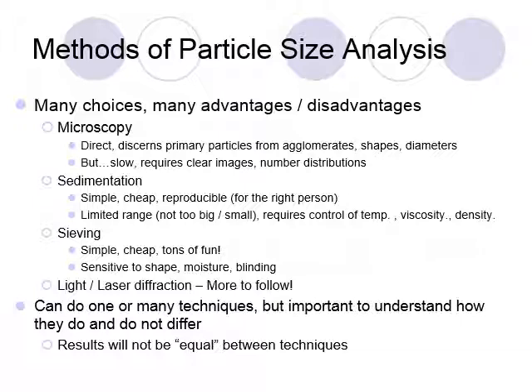All of these choices do matter to get you the particle size in the way that you want the results to best apply to your process. With each advantage and disadvantage, when you make a choice as to how to look at your particles and get the numbers and shape information that you want, you need to be making the correct choices as an engineer to best fit your process and the techniques that you have, and to convert between the techniques.